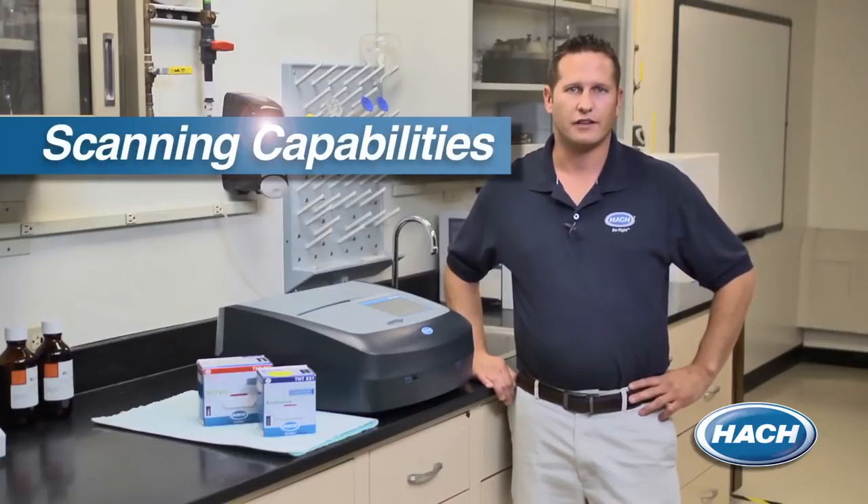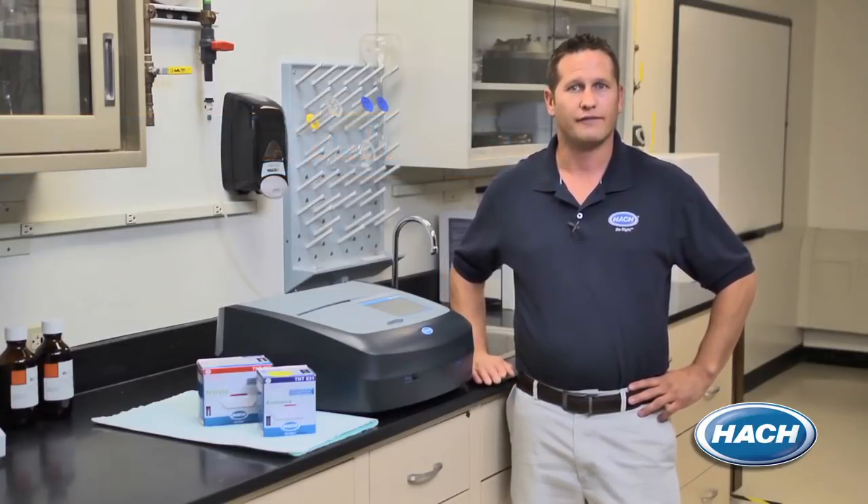One of the greatest benefits that the DR6000 can offer is the flexibility to run both ultraviolet and visible wavelength methods. The UV capability allows you to run compliance methods like UV organics and UV nitrate to help optimize your treatment systems.